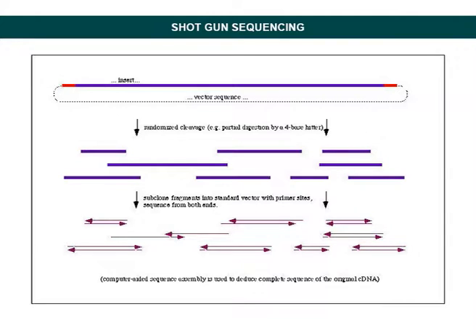Although this approach is very compatible with automation, the gaps produced by this method can be completed only through a direct approach. In conclusion, shotgun sequencing is a much faster process than clone by clone sequencing. Whole genome shotgun sequencing uses a fraction of the DNA that clone by clone sequencing needs. Shotgun sequencing is particularly efficient if there is an existing reference sequence. Also, it is much easier to assemble the genome sequence by aligning it to an existing reference genome, and less expensive than methods requiring a genetic map.